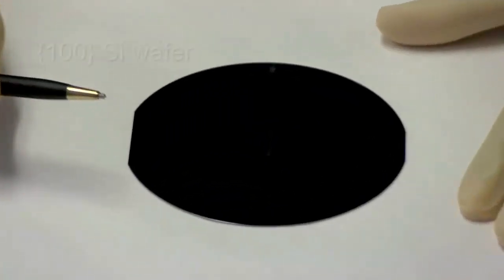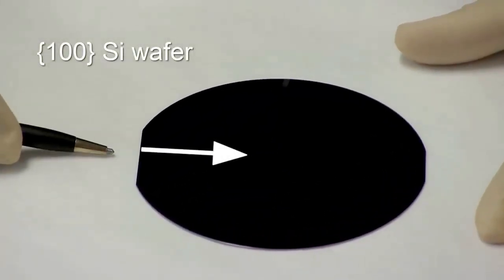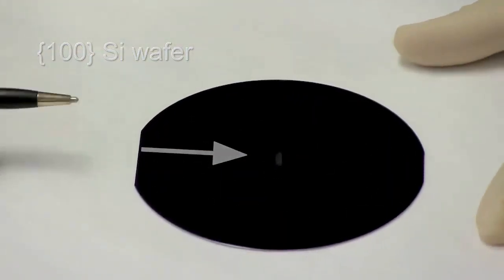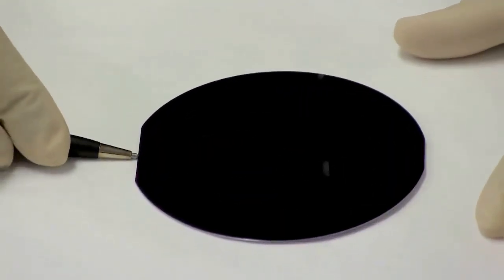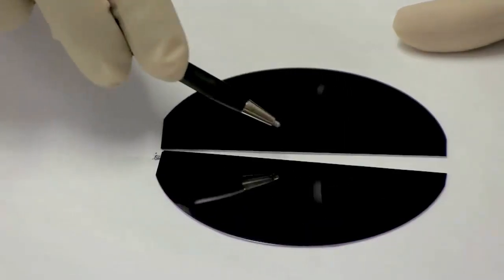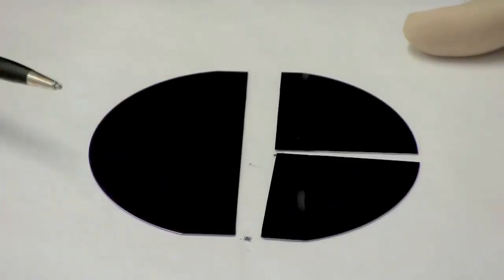I've got my diamond scribe and we are going perpendicular to the flat. The crystal planes are lined up this way, so we want to go along one of the crystal planes. I'm going to go perpendicular to the flat and initiate a fracture right there, and I'm going to do one more — and that looks pretty good.